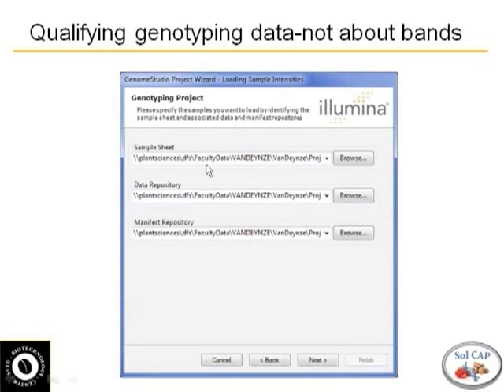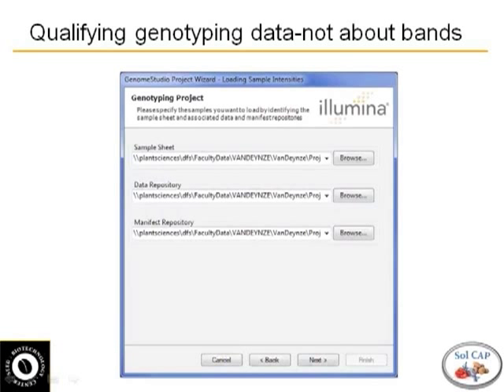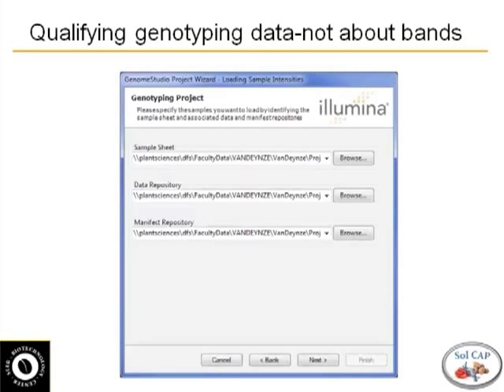You ask for a sample sheet and this basically comes directly from your lab or something you're going to have to set up for your lab that the Illumina software pulls out. So it asks for the sample sheet, so it tells you what are the names of your samples and what wells are they when you submit them. Some things are usually processed in 96-well plate where you're going to collect tissue, extract DNA, usually 96-well plate, send that to your lab and they're going to send you a bunch of data for each of those.